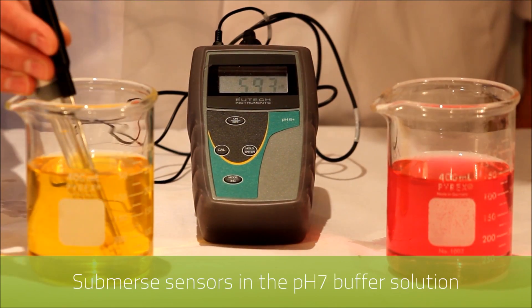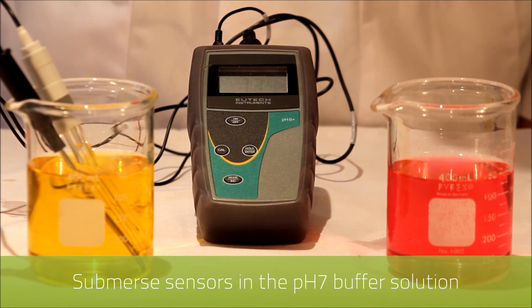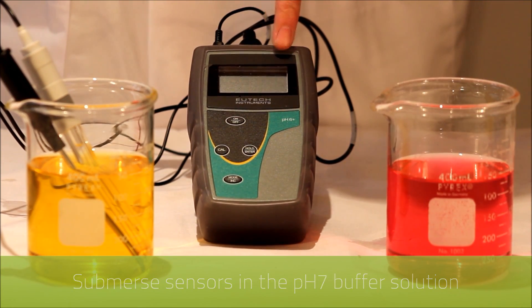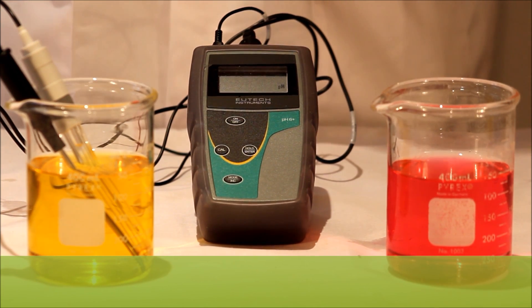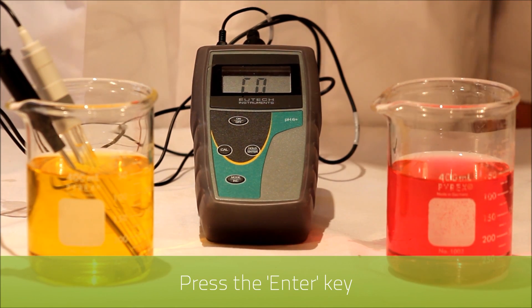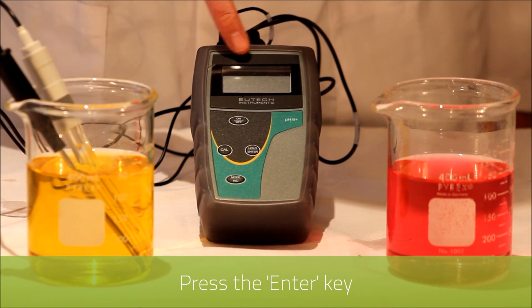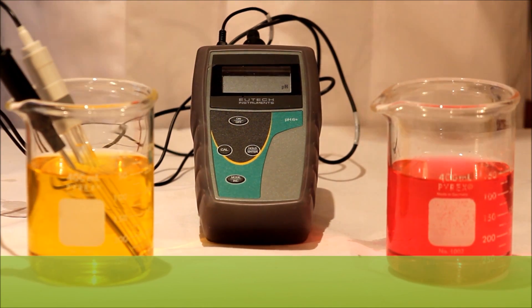We submerse both the temperature and pH sensor into pH buffer seven, and as you can see it has recognized the reading. Once this reading stabilizes we then press the enter key. You'll recognize that the readout has now adjusted to seven pH.